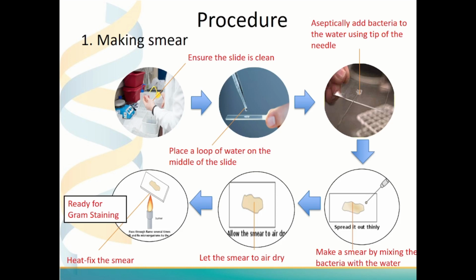And the second one, we have to place a loop of water on the middle of the slide, as you can see from the picture.